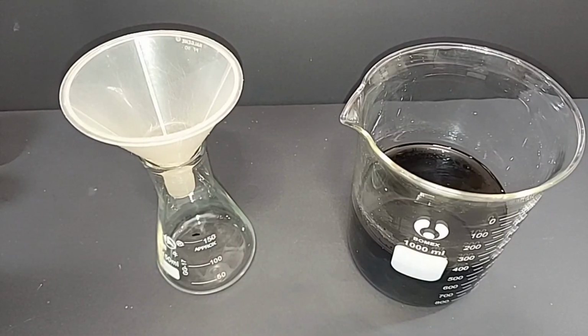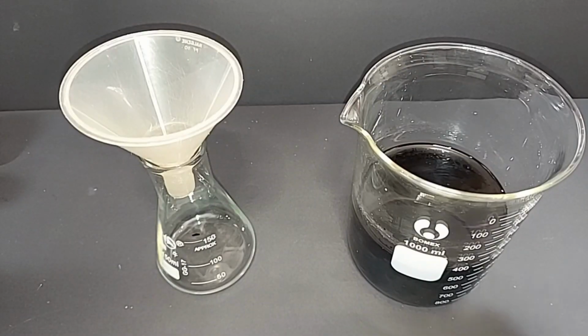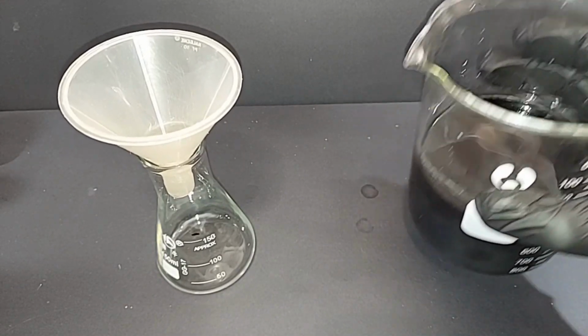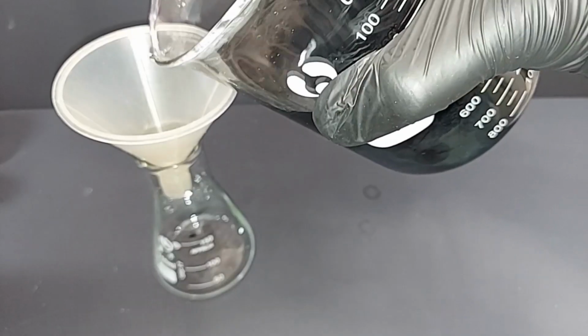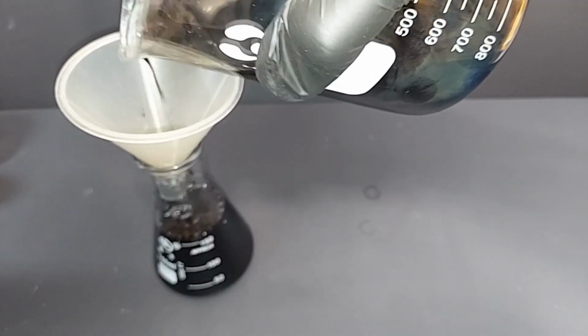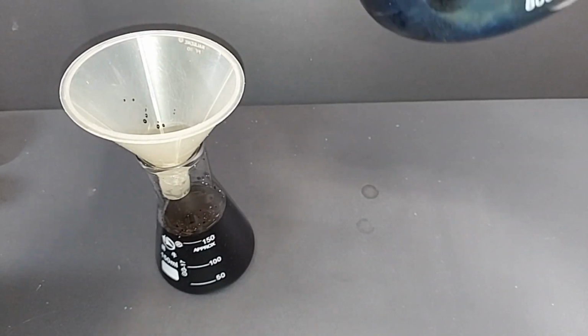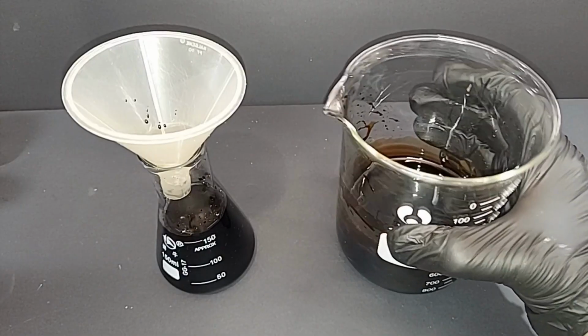There's approximately 480 milliliters in the beaker, and 1/3 of that turns out to be about 160. So I marked this, I don't know if you can see it, at about 160 milliliters on this side here. And boy, the most basic of things, just dividing this up into 1/3 and 2/3, but here we go. Okay, doesn't have to be exact, I just wanted to have some decision. Gosh, this does look like motor oil, I really have to say.